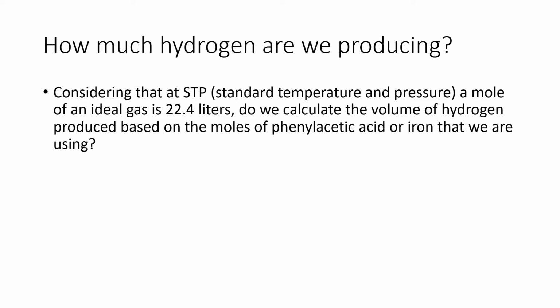In order to make these calculations, we need to know whether we need to use the moles based off of the phenylacetic acid or the moles based off the iron. I won't say exactly which one just yet, but try to follow along when we go over the mechanism, and you'll see which reactant is in charge of producing the hydrogen gas.